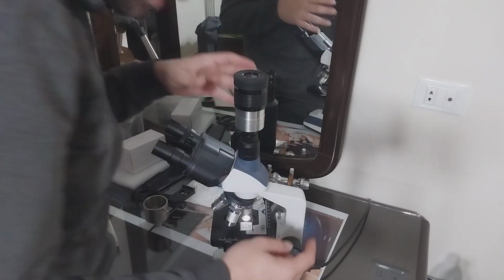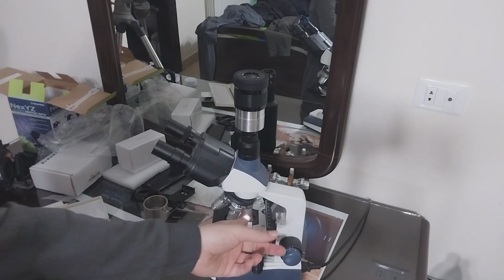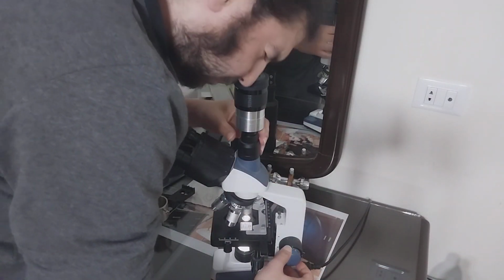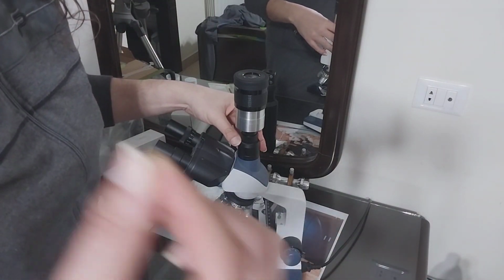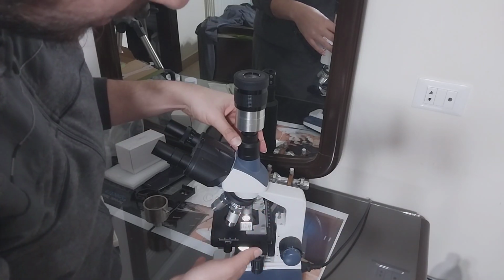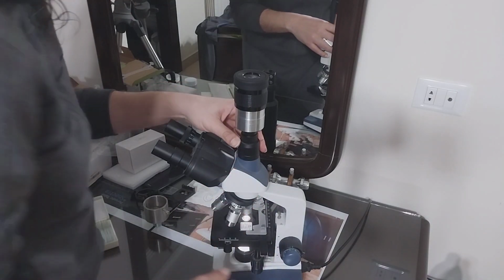So this is the eyepiece. Now you can see the change, because now it's shorter from here to here. The distance is shorter than before, so the focus will change. So you'll have to see the focusing now, and feel the focusing, because this means I will have much more range, much more freedom in focusing.